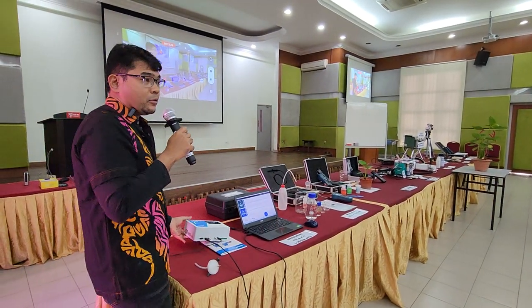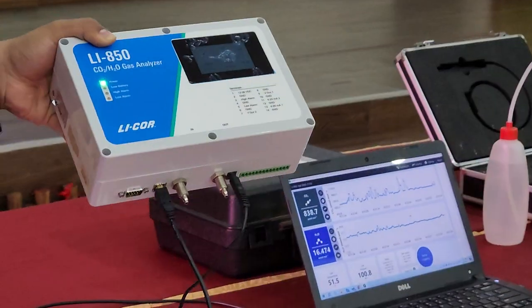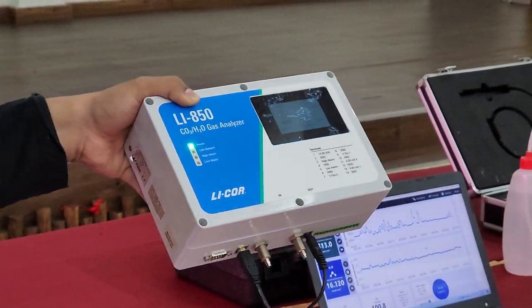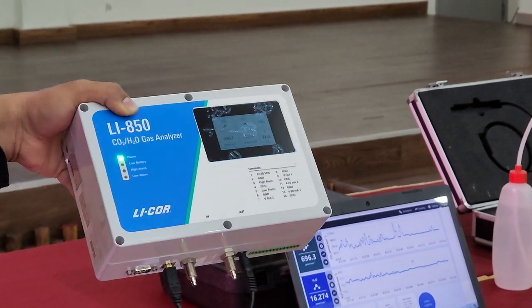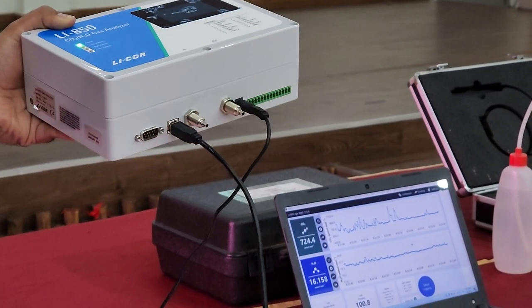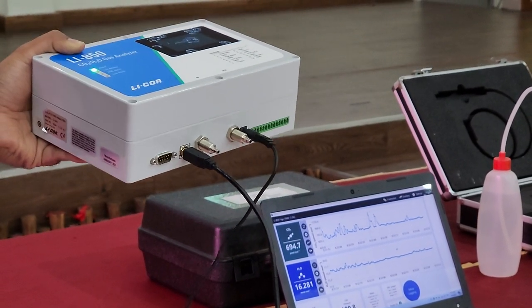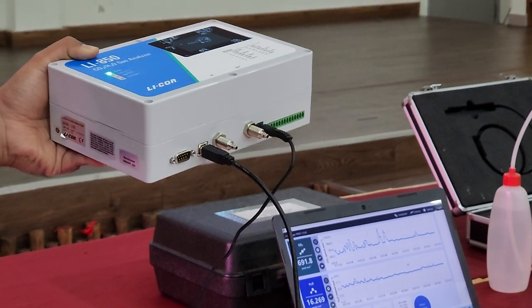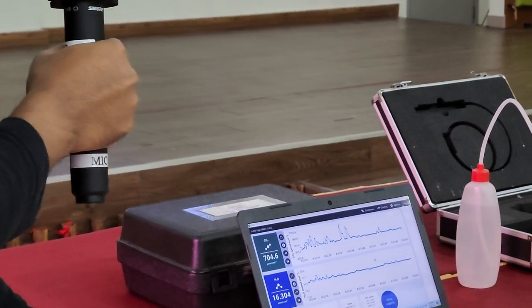Coming back to this little box here. This is a CO2 H2O analyzer. You see the word, it says gas. Don't point at me, point at the machine. I'm not the celebrity now. So it says here it is a gas analyzer. Therefore, it's measuring gas. Never ever put this into the pond hoping to know what the water volume in my pond is. The answer is more than 1,000. A lot more.